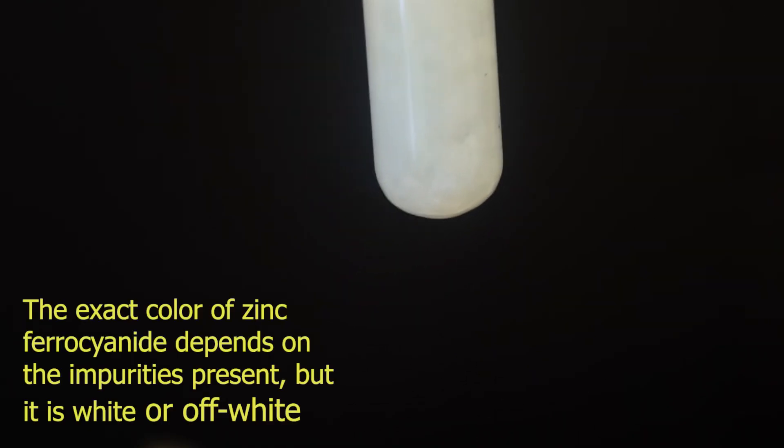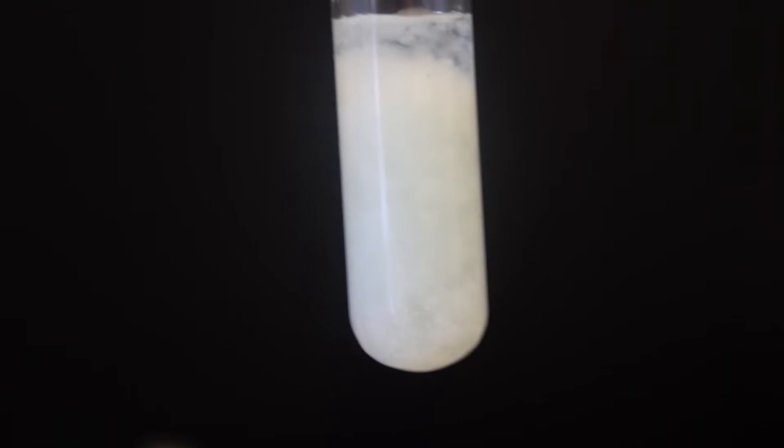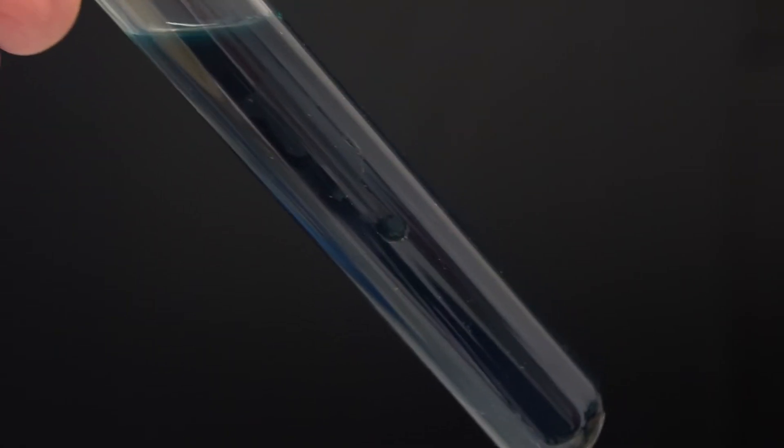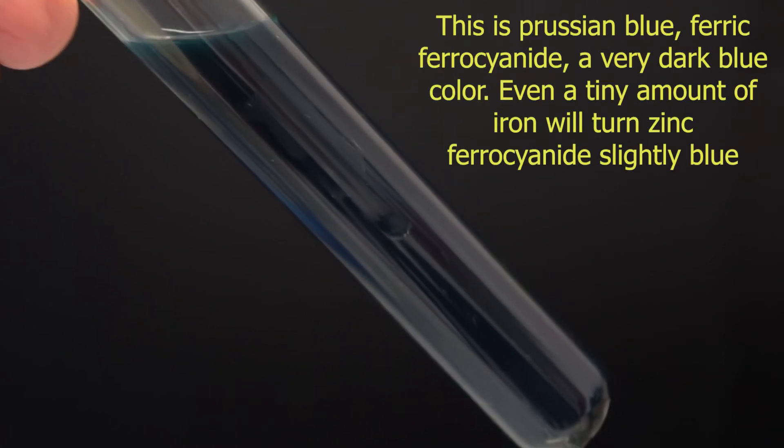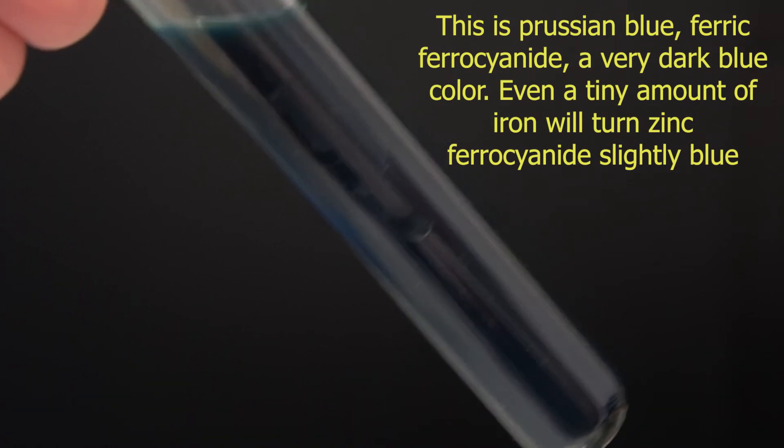Reacting potassium ferrocyanide with magnesium sulfate gave no immediate reaction, and reacting it with ferric chloride gave an intensely blue-colored compound called Prussian blue, which we'll cover in a later video. We performed these reactions just as additional references.